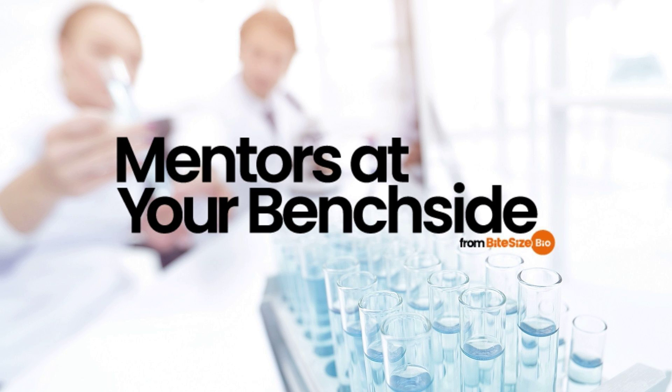Absolute or 99 to 100% ethanol. Some procedures that are sensitive to the presence of water require absolute ethanol. A common method to produce ethanol with a higher concentration than 95% is to use additives that disrupt the azeotrope composition and allow for further distillation. For this reason, absolute ethanol sometimes contains trace amounts of additives such as benzene. Absolute ethanol is hygroscopic, which means it attracts water, so don't expect it to remain 100% ethanol for long after it's left uncapped.